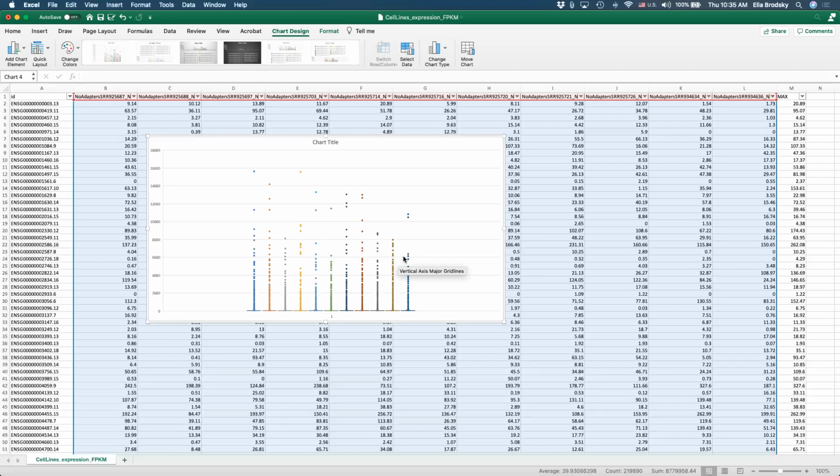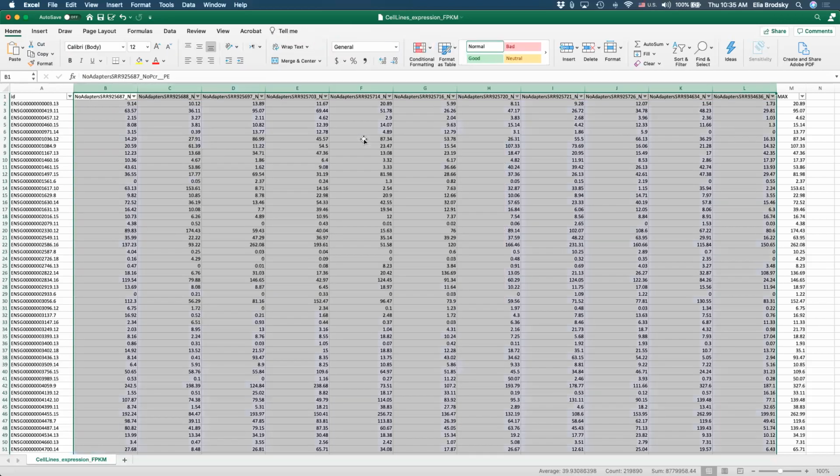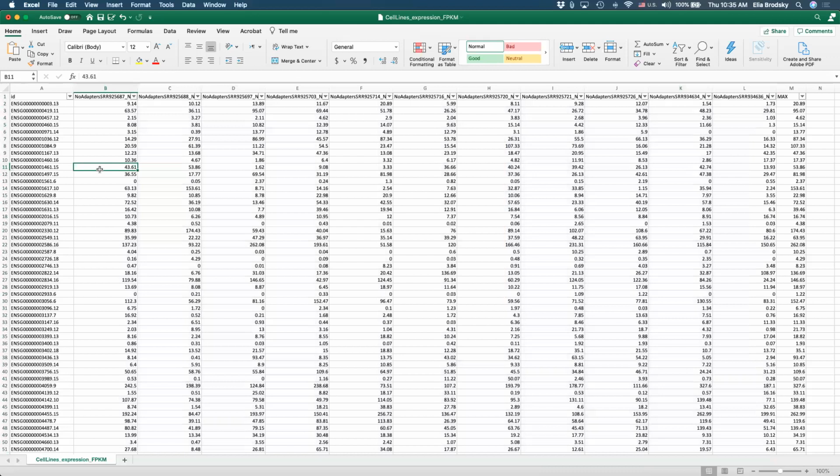What we can do about it is we can look for a way to normalize this data and make it more like a normal distribution. Okay, so what we are looking at here is the distribution of data, how distributed our values are.